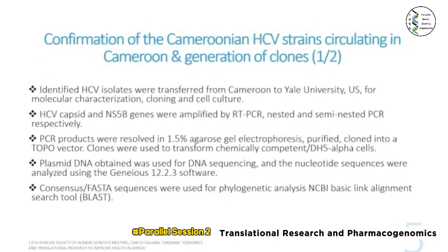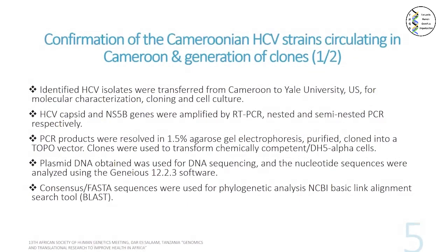For the first objective, for the first research question, we identified HCV isolates, and these were transferred from Cameroon to Yale University in the United States for investigations that included molecular characterization of HCV, gene cloning, and cell culture. HCV capsid and NS5B genes were amplified by RT-PCR, nested and semi-nested PCR, respectively. PCR products were resolved in 1.5% agarose gel electrophoresis.